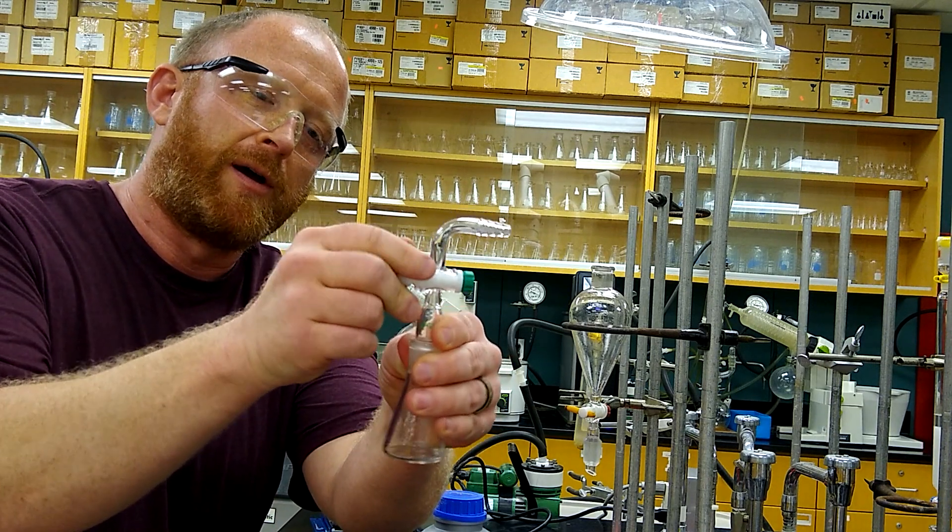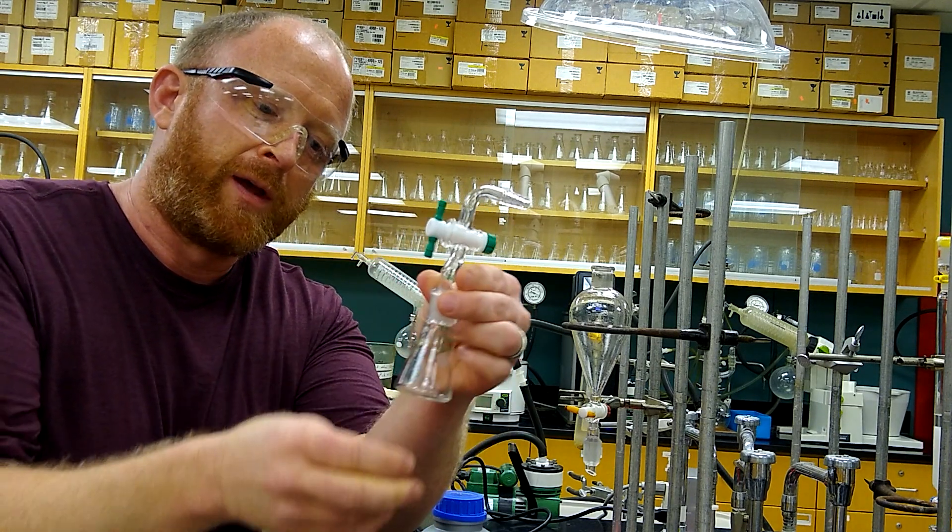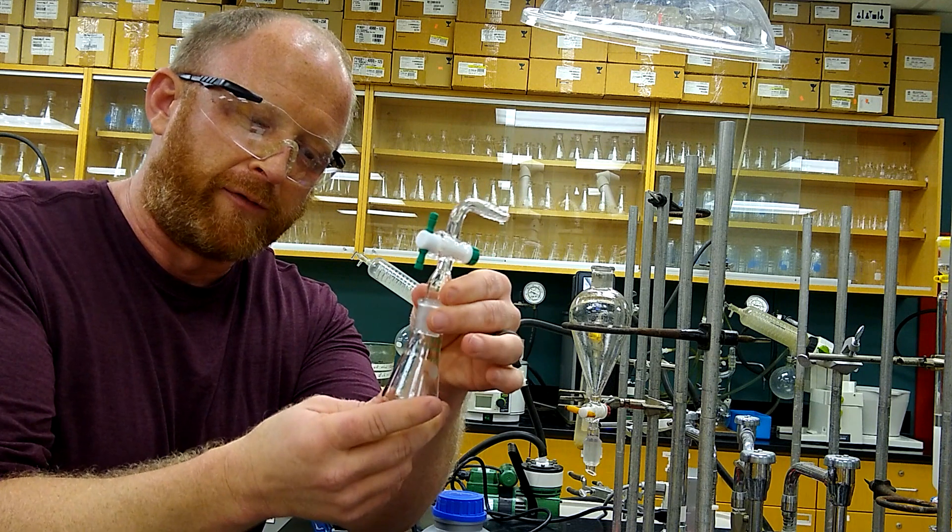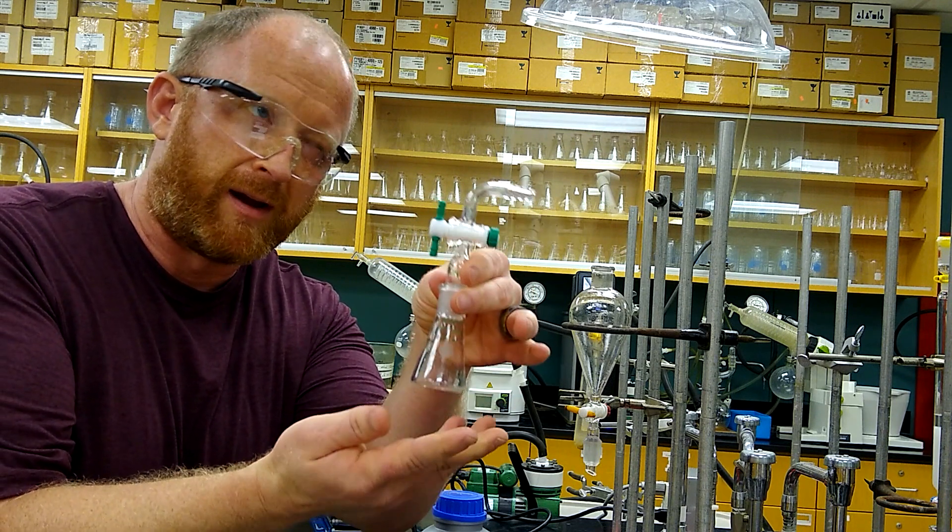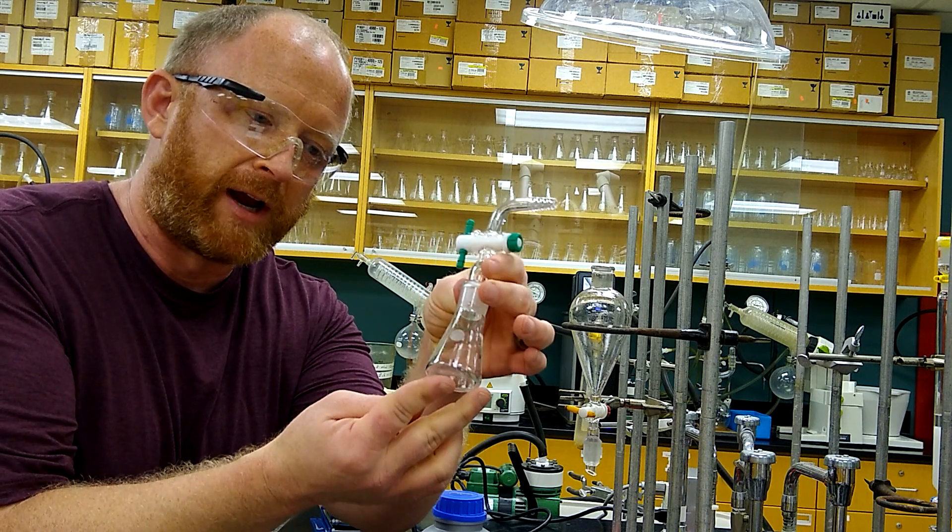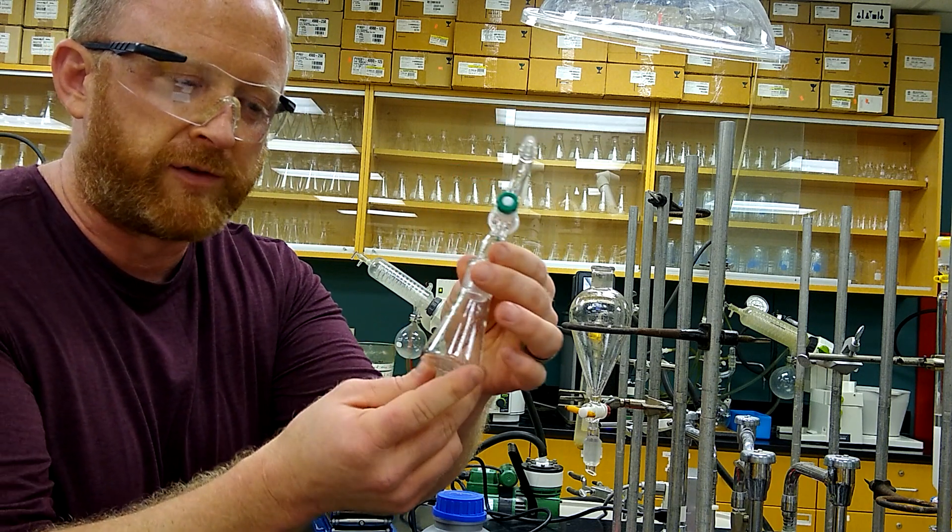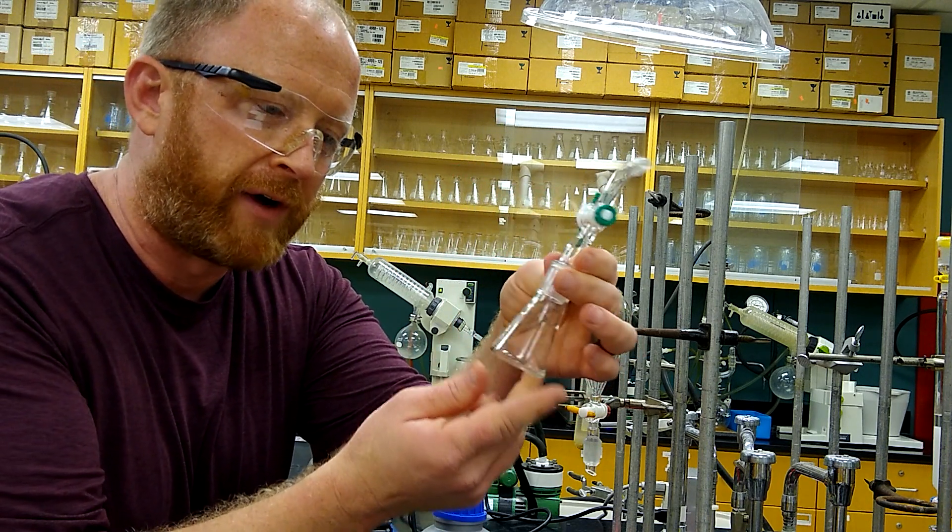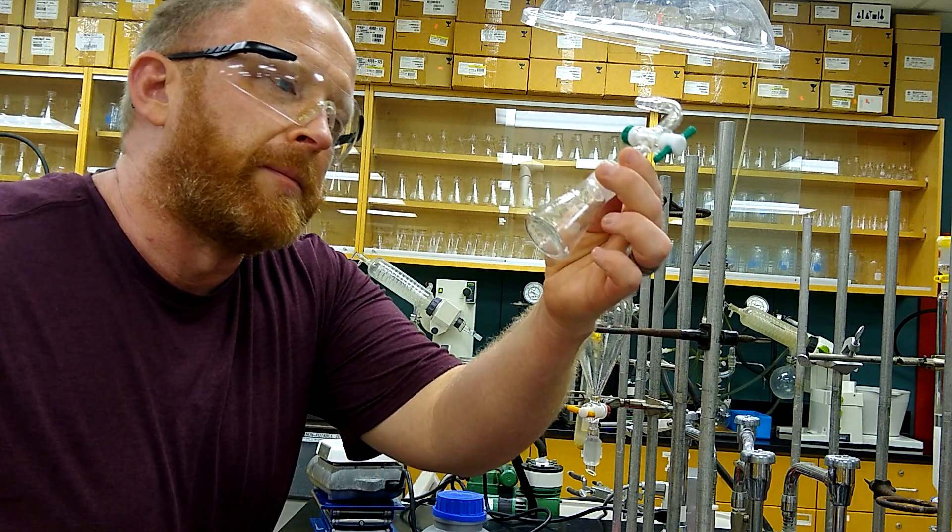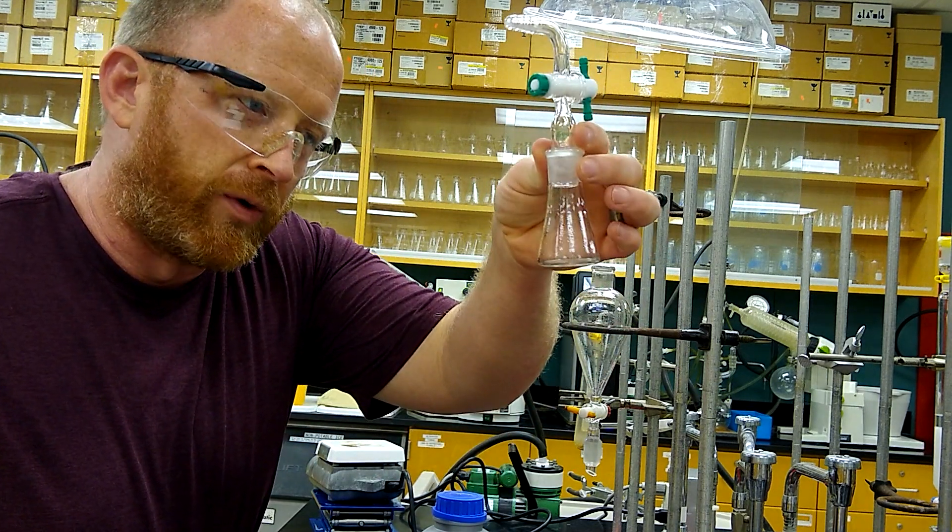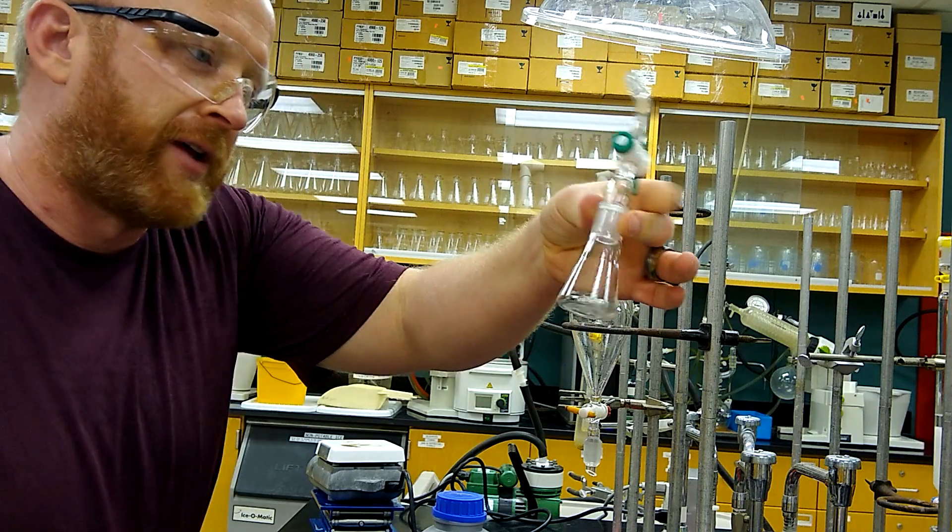That'll help us get rid of any trace bromopropane we might have, because our product should be a solid melting at about 45 or so. Since we still have some liquid remaining, the vacuum pump should take care of that.